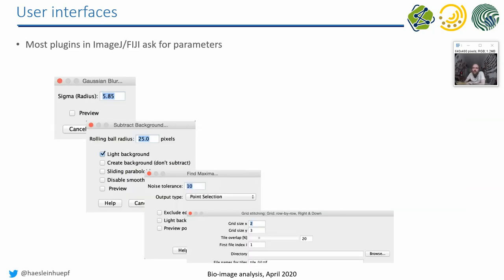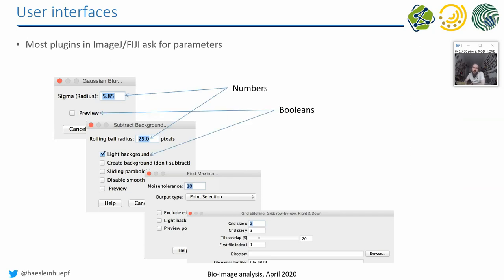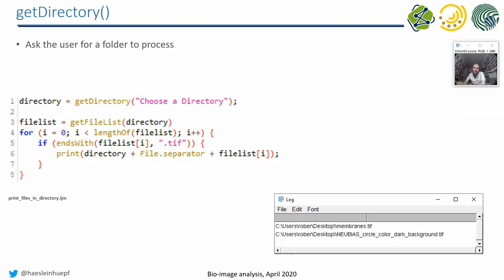So there are many plug-ins in ImageJ opening these kinds of windows where you can enter numbers, booleans (that's the technical term for a checkbox), you can ask the users to make a choice, a selection, and you can also enter files and folders. And I will show you now how to do these things.